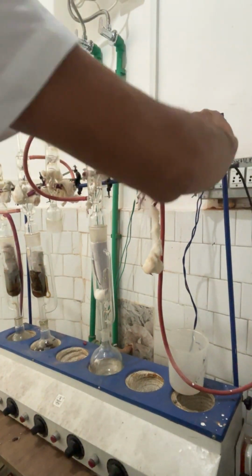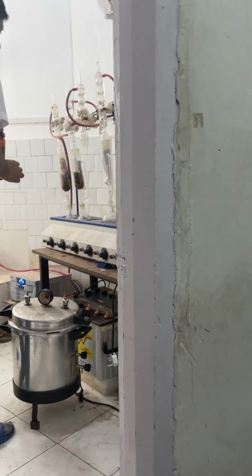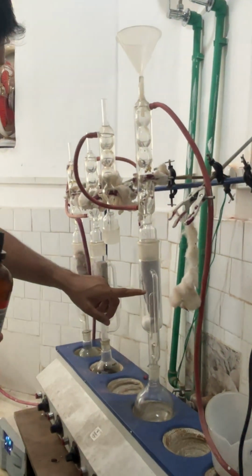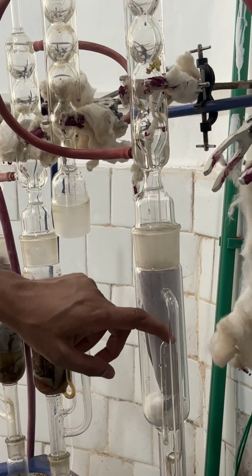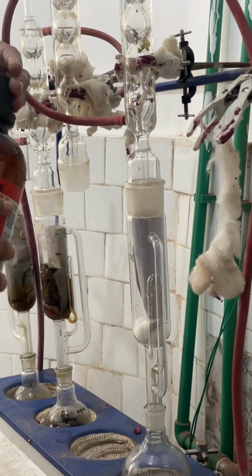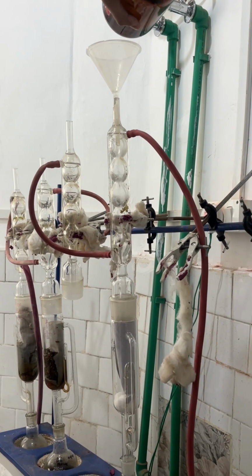So the solvent here, primarily we use hexane first. So now we put a funnel and we will fill it first up till here. Okay. So when the solvent reaches here, due to siphoning, it goes back into this jar, the flask. So we'll put first.